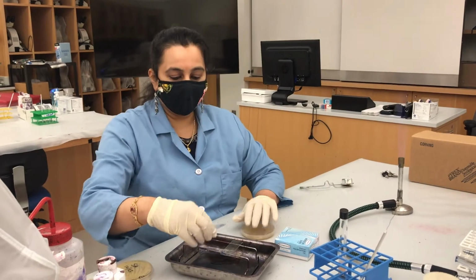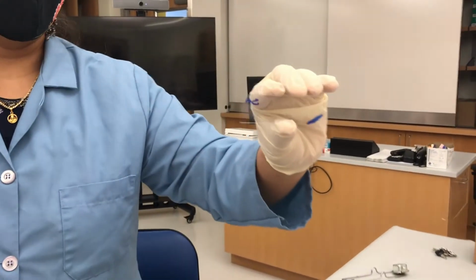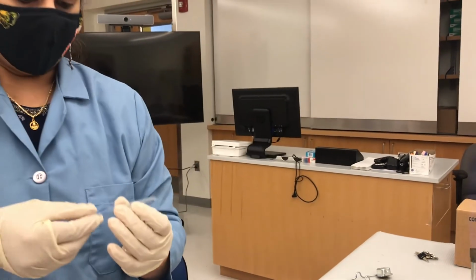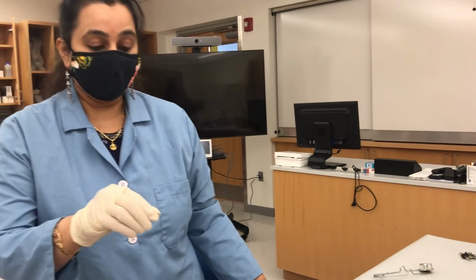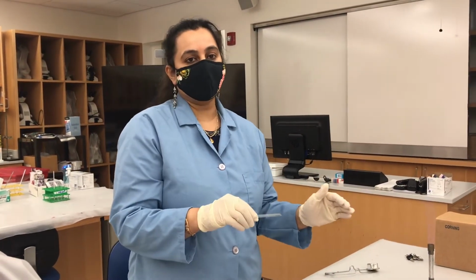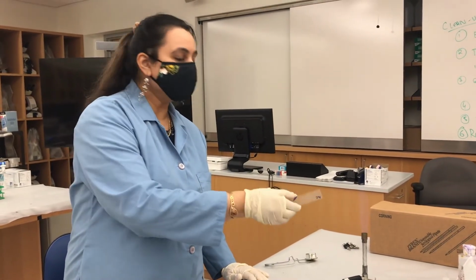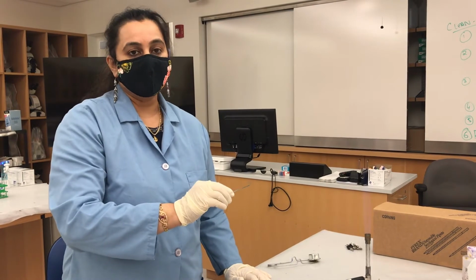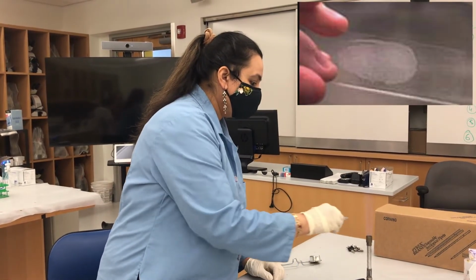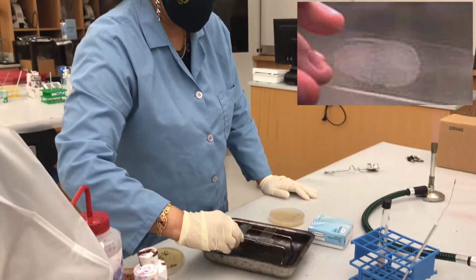Now you can clearly see that the solid culture on the slide is all dried up. When everything is dried up, when there is no visible water, it's ready to be heat fixed. So what we are going to do is gently run the slide through the flame 2 or 3 times. 1, 2, and 3. That's it. This is good.